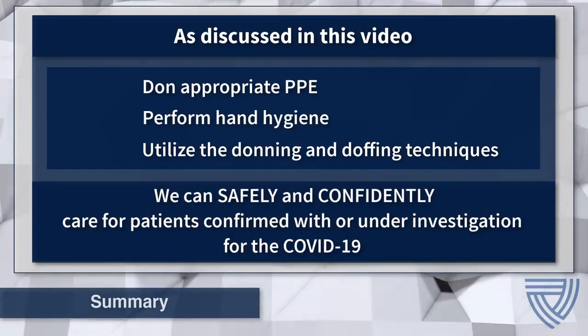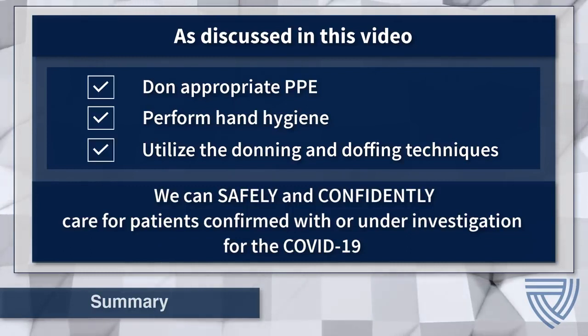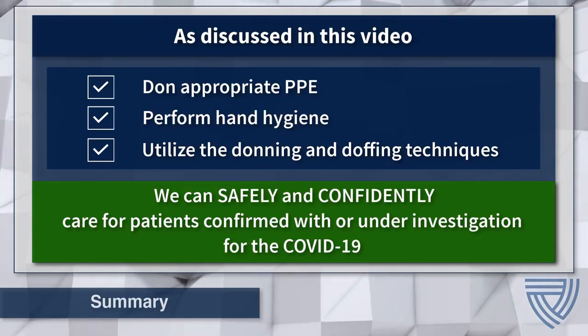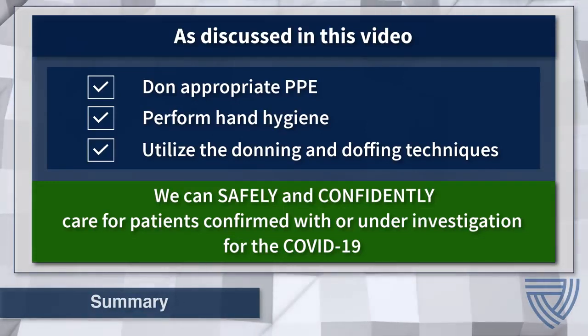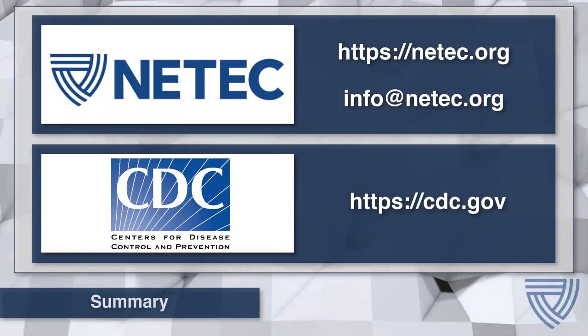At this time, there is still much to learn about COVID-19. Despite this, healthcare workers that don appropriate PPE and utilize the hand hygiene and donning and doffing techniques discussed in this video can be confident in their ability to safely care for a patient confirmed with or under investigation for COVID-19. Please continue to follow the CDC for news and updates as events unfold.